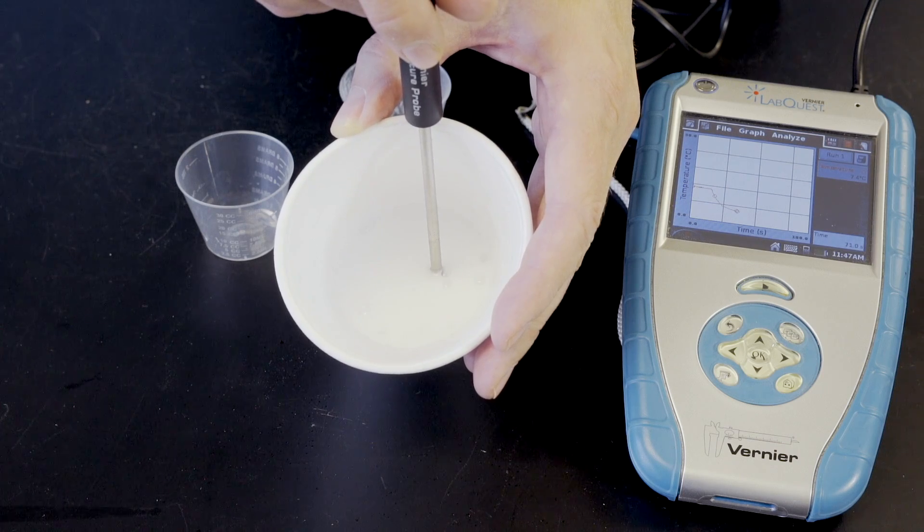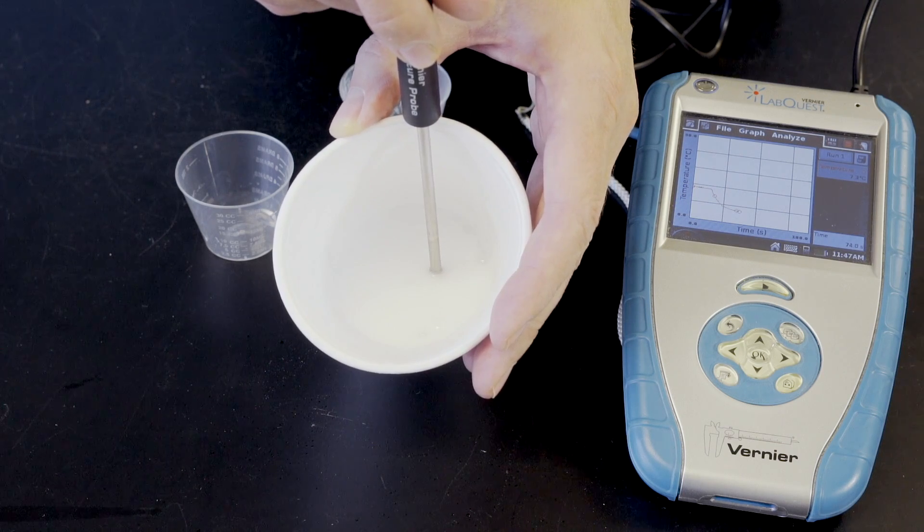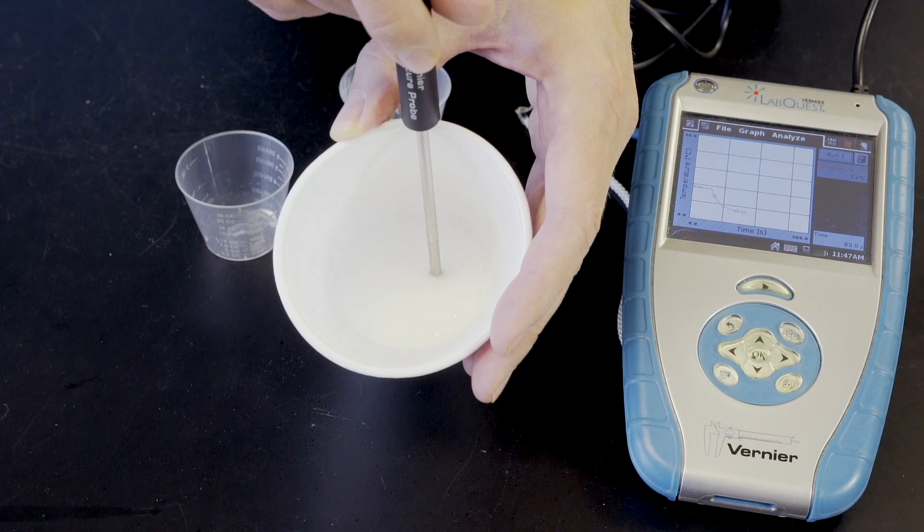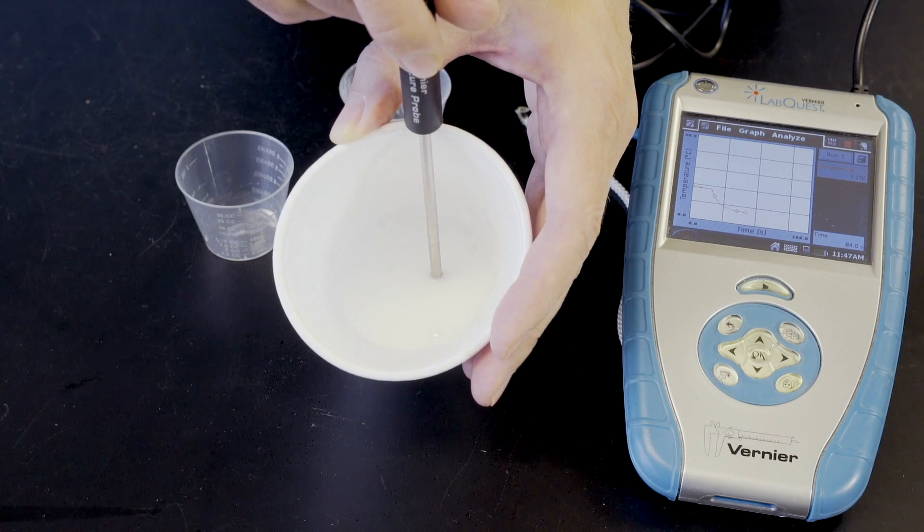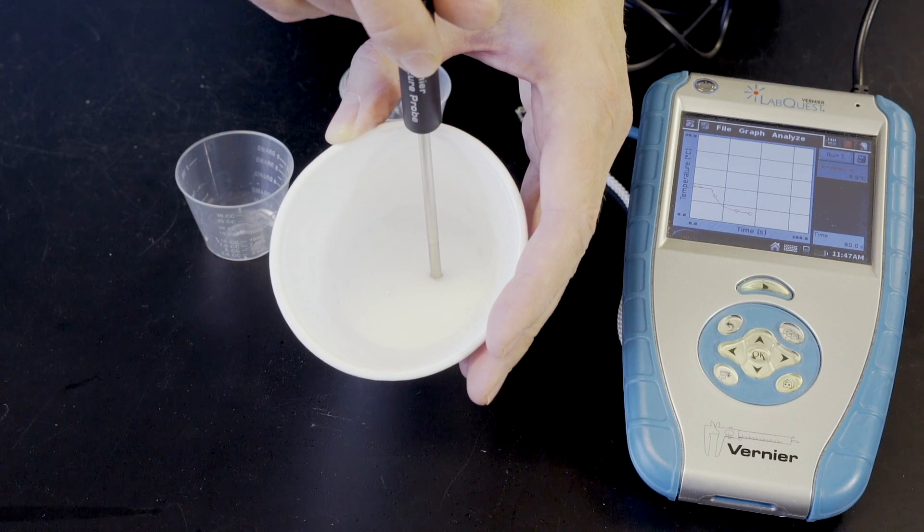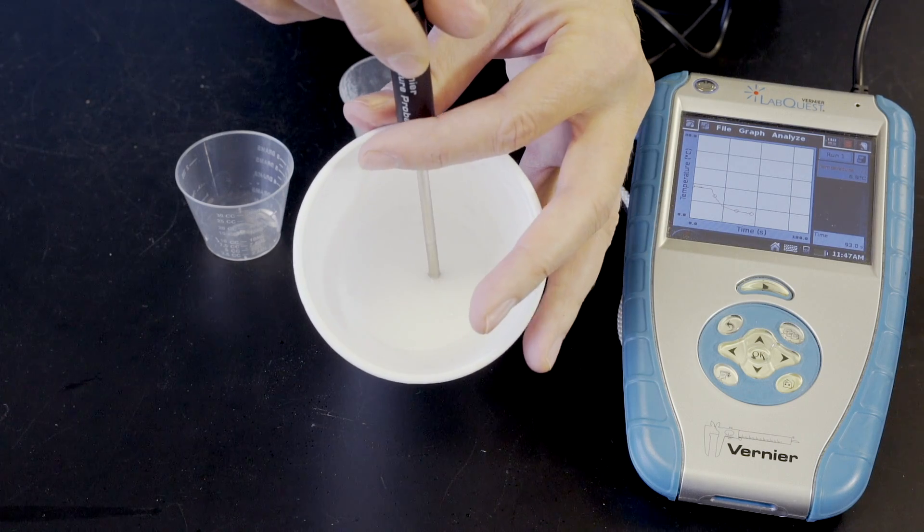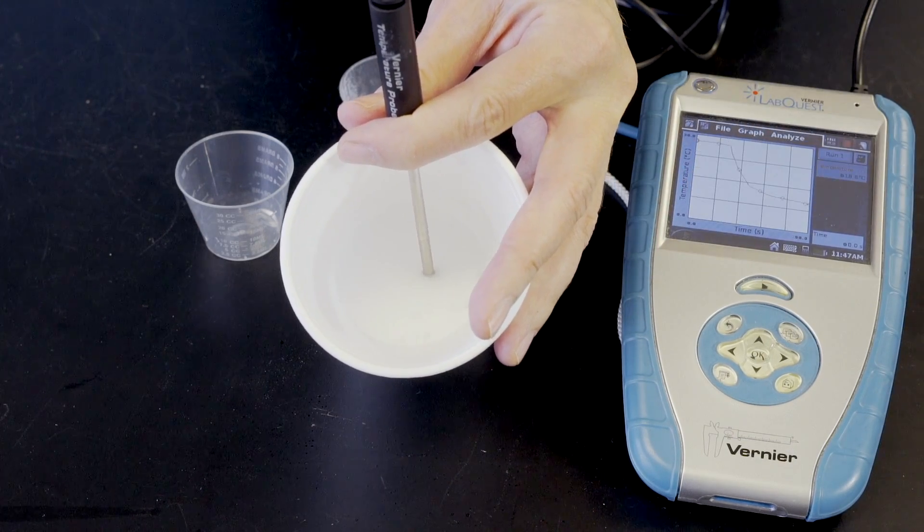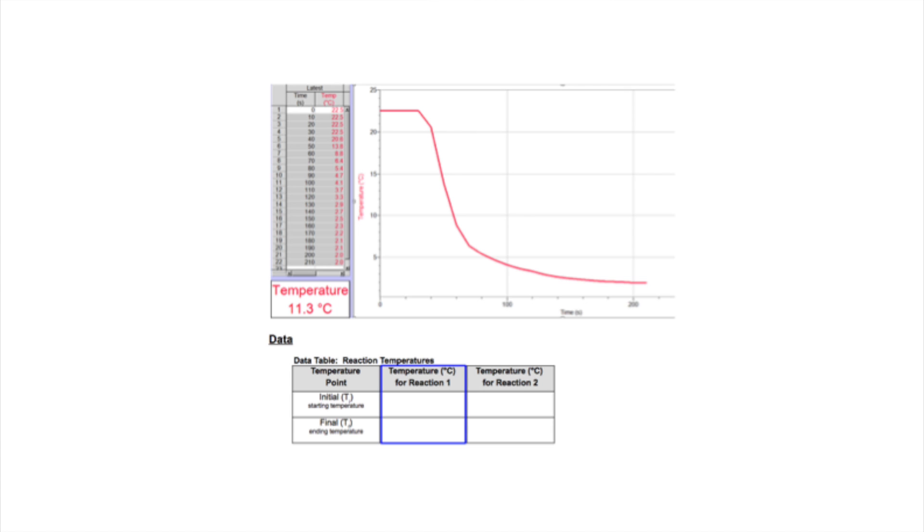Recording continues until a plateau has formed or five minutes has passed. I'm going to let this go just a couple more seconds until I'm sure that my temperature is done changing. At that point I'm going to stop recording. You will use this graph and data table to record the initial and final temperatures into the data table in your lab book and you will use the shape of this graph to sketch into the graph provided on sheet six.